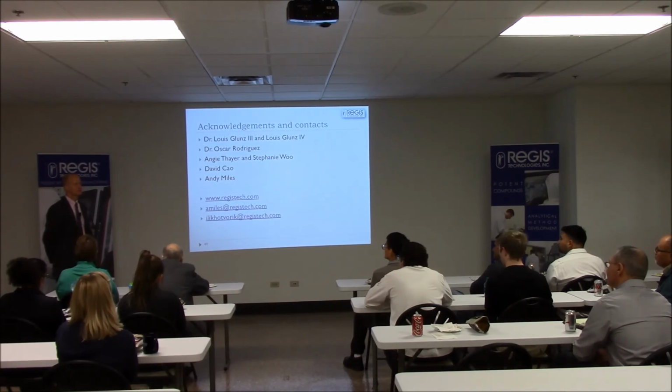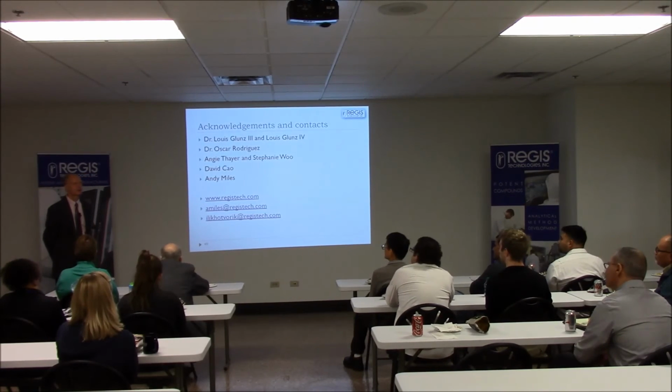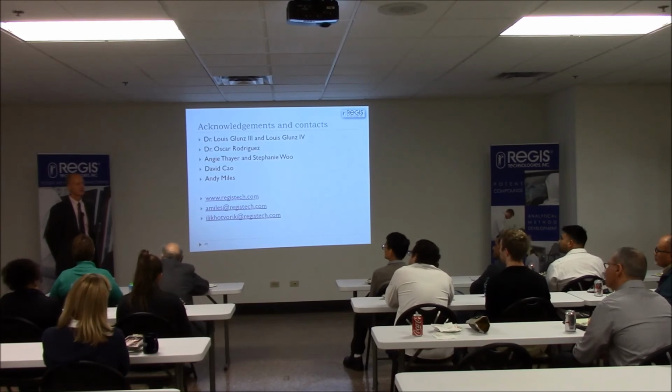Very often HMBC can also be fine-tuned to show correlations with 4 or 5 bonds even. And these are extremely important, and we have one case where we were able to elucidate the structure of one isomer versus another isomer using a 5-bond correlation on the HMBC spectrum, which is not typical, but it was very helpful in this case.